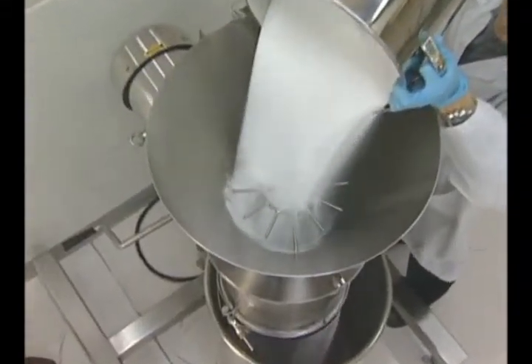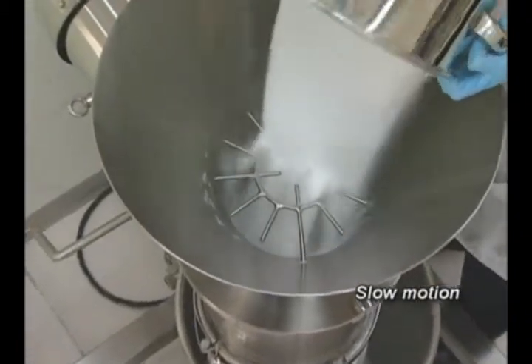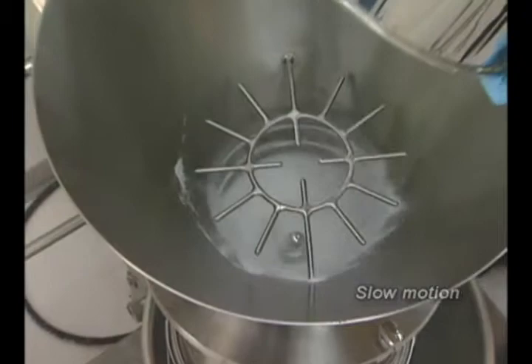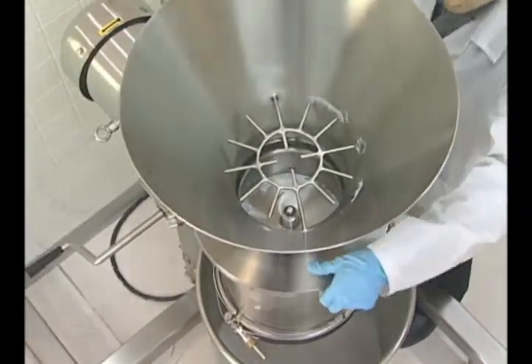Based on Quadro's proven technology, the unique in-line design of the Quadro Sifter reduces the amount of airborne fine particles, reducing product waste, potential for dust explosions, and operator exposure.